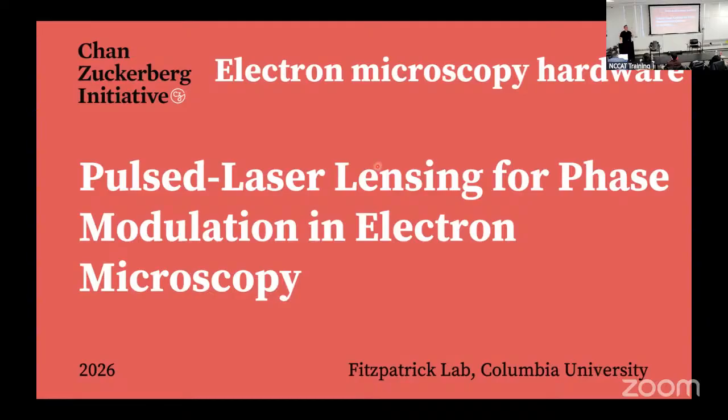They are just coils that a current is passed through, metal coils. They then apply a field. That field is localized, and it basically affects the spreading and sort of shrinking and expansion of the electron beam as you form an image. And that has been very, very powerful. In material science, we can get down to 53 picometers, so you can really see a single hydrogen bond using these lenses, but there's always room for improvement.